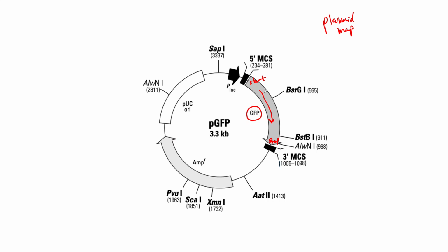And its start codon is up here near something called the PLAC. This is a promoter. And it's a bacterial promoter. It's a promoter that bacteria use for another gene, typically in a normal wild-type bacteria. This promoter would be found upstream of a gene called lactase, or LAC-Z.